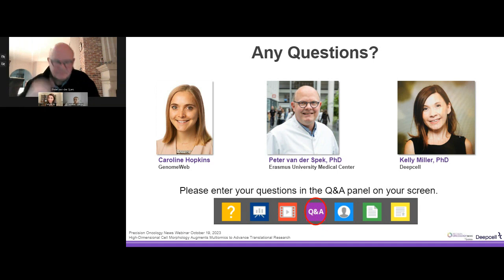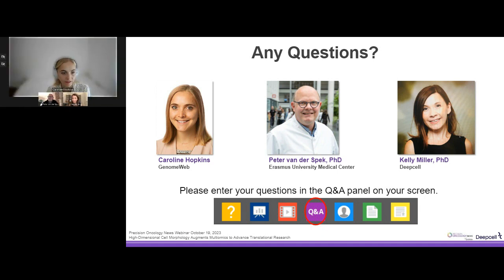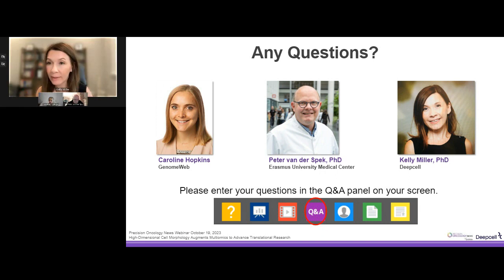Absolutely. I don't know if you had anything to add on that, Kelly. No, just from a technical specification standpoint, I'll just say that the UMAPs are generated in real time. And in terms of the updating, when you analyze the data, you can of course reproject if you would like to get a more granular look at specific morphotypes and look for subtypes within that.